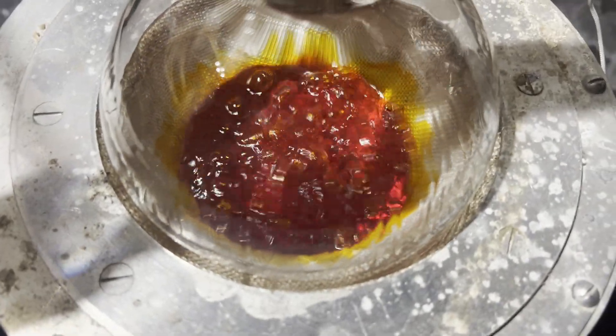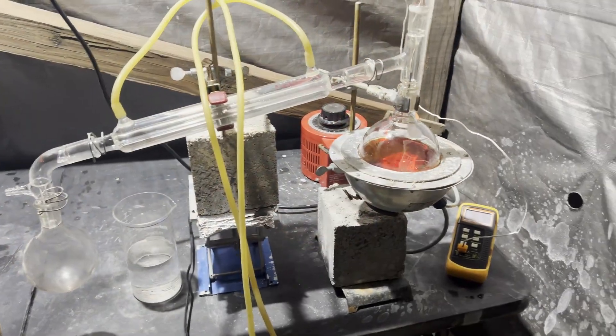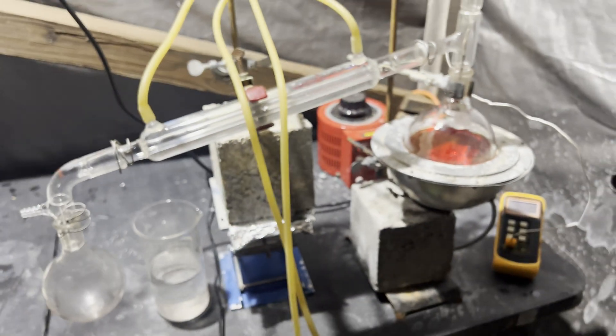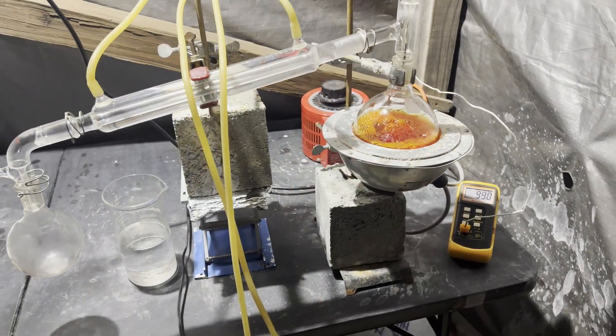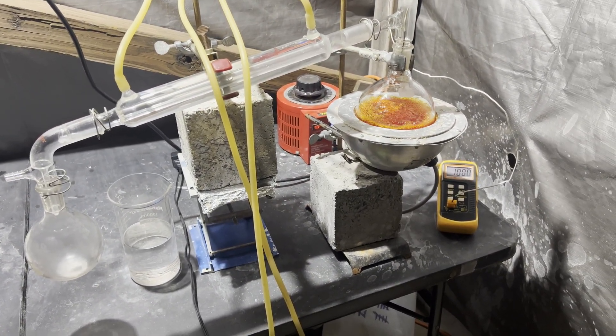I couldn't find any information on a toluene-aniline azeotrope — I did find some on a toluene-pyridine one, but that's not aniline. Anyway, that's the line of reasoning I'm choosing to follow. It's important to separate the water before distillation, because the condensation reaction that just occurred can be reversed at elevated temperatures in the presence of water.